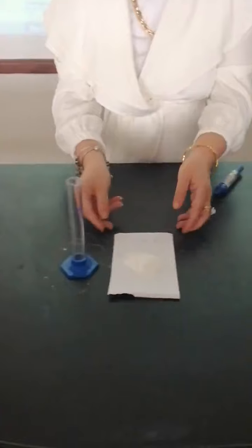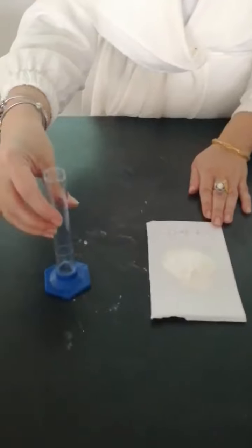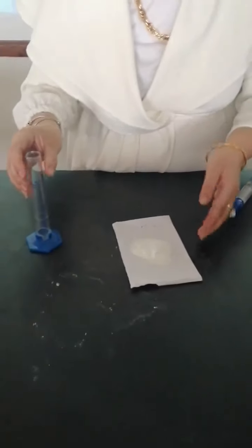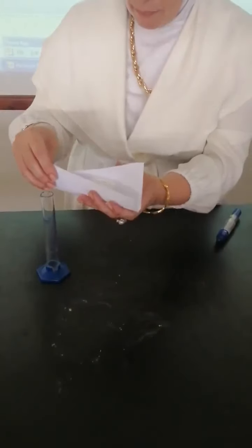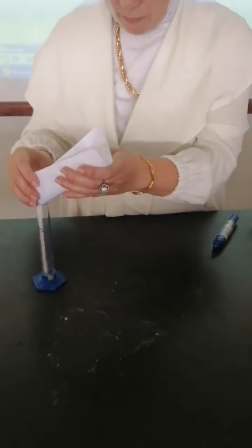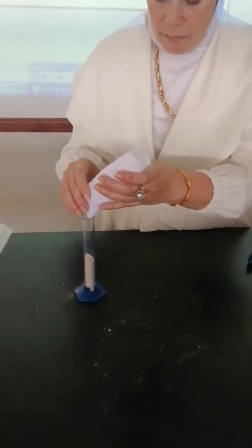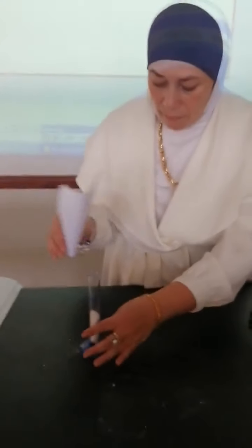So, starting with measuring tap density and bulk density, we need 10 grams of zinc oxide and a 25 ml cylinder. I need a watch. Just roughly adding the powder to the cylinder, and just read the volume.